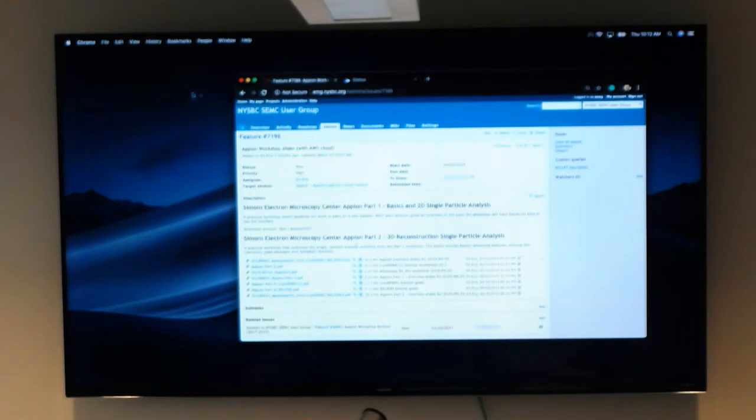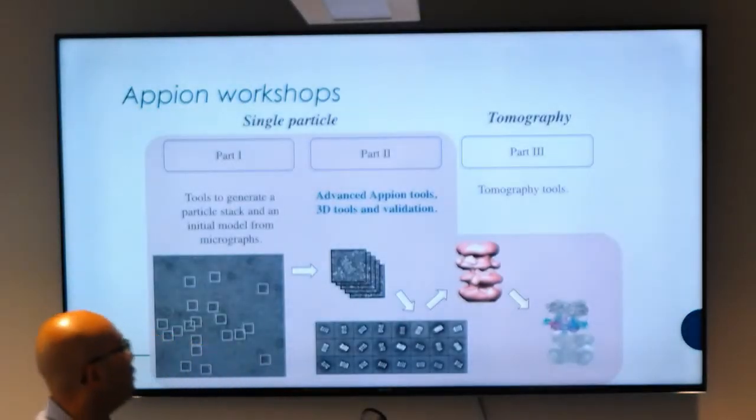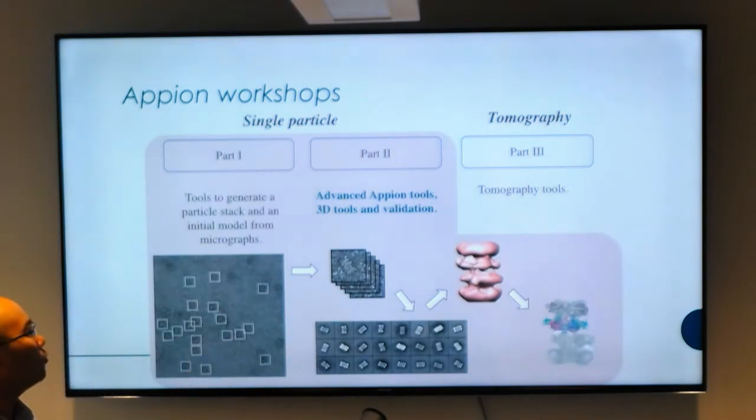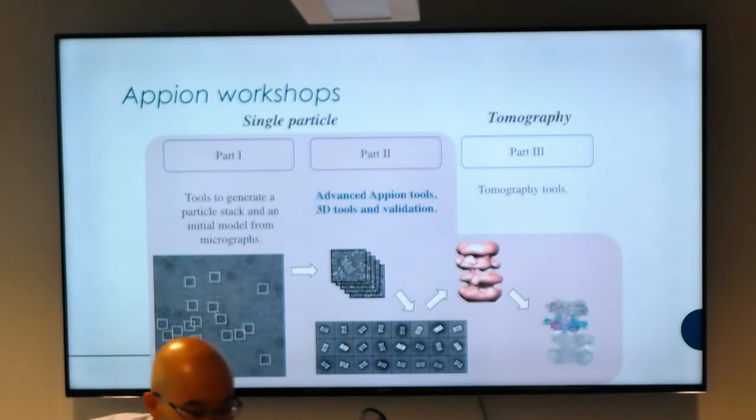Okay, so let's get back to that. So where are we today? Appion Part 2, we're trying to cover perhaps some advanced Appion tools. We'll get to that later if people have questions. And on to the 3D analysis part of the single particle workflow.